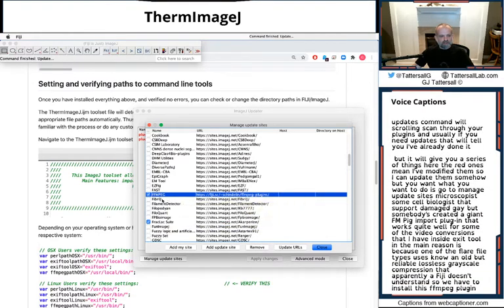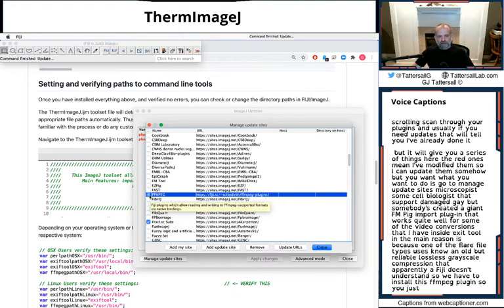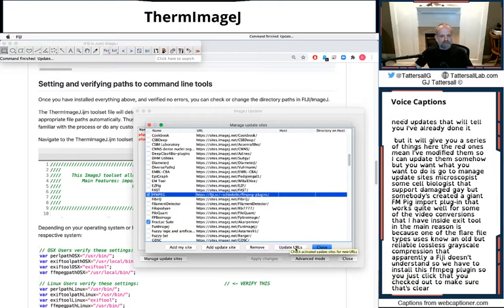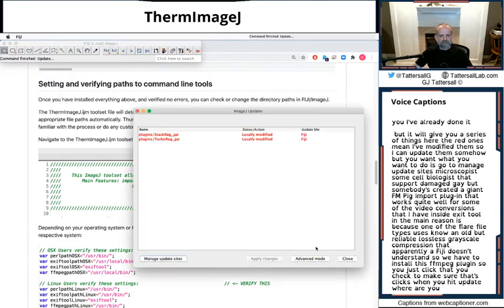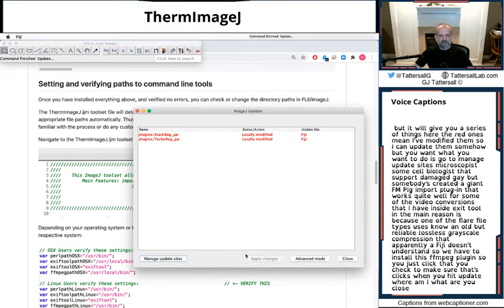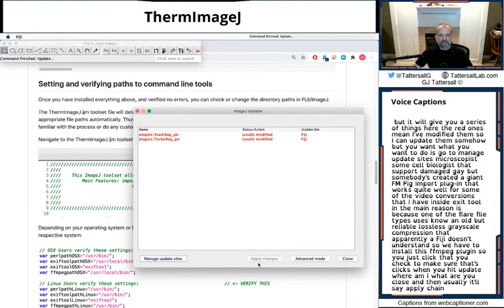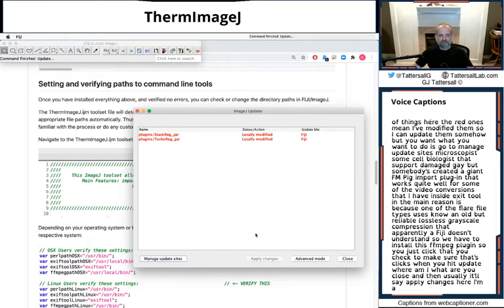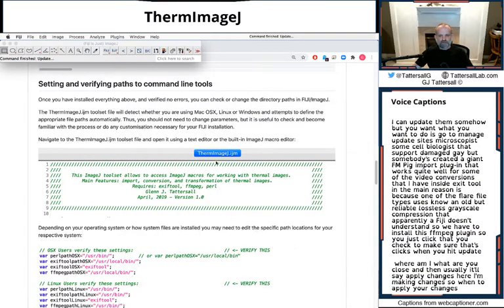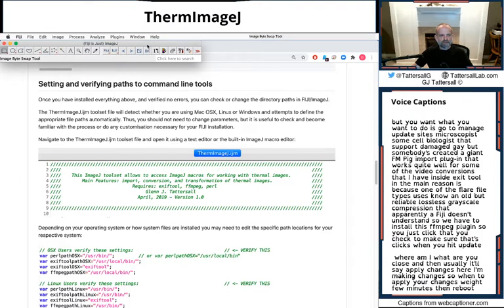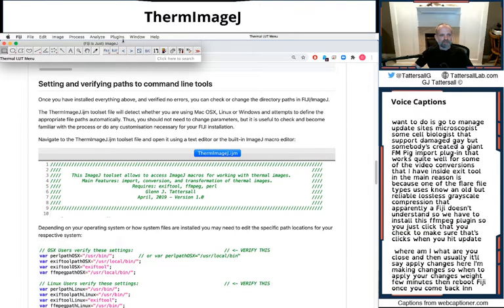So you just click that. Make sure that's clicked. And you hit update. Hit close. And then usually they'll say apply changes here. I'm making changes. So once you apply your changes, wait a few minutes and then reboot Fiji. Once you come back in this Fiji. I'll reboot Fiji.